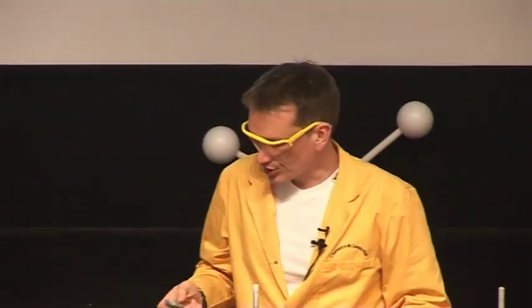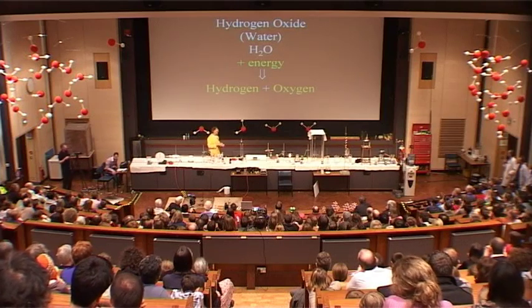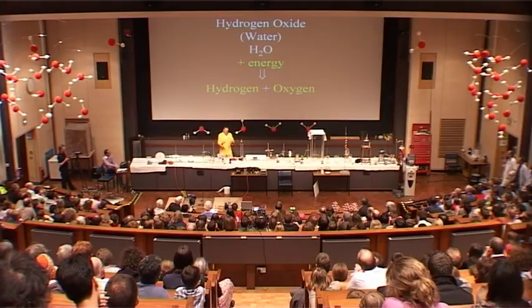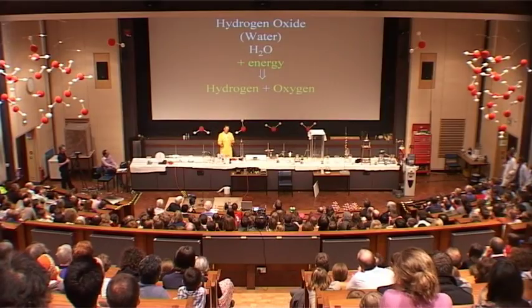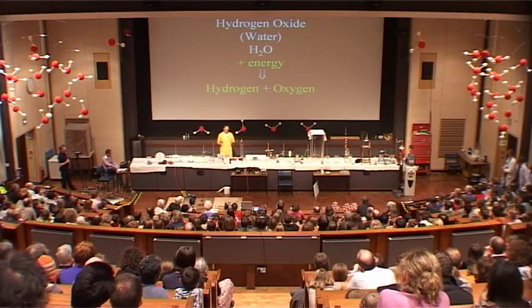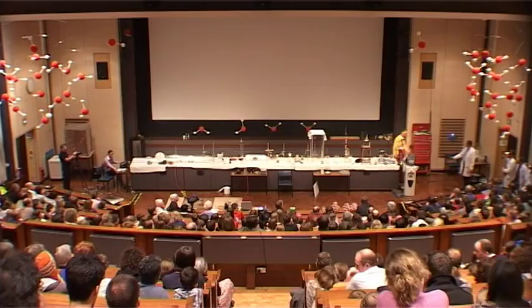Now, we can show the equation for this reaction where we're splitting up the water. We have our water, or hydrogen oxide, as somebody might call it. So we're putting energy into this, and we're splitting it up, and we get the gases, hydrogen and oxygen, in the ratio 2:1. So now we're going to have a look at these gases and see the properties of these. So first of all, we'll start with the gas hydrogen.